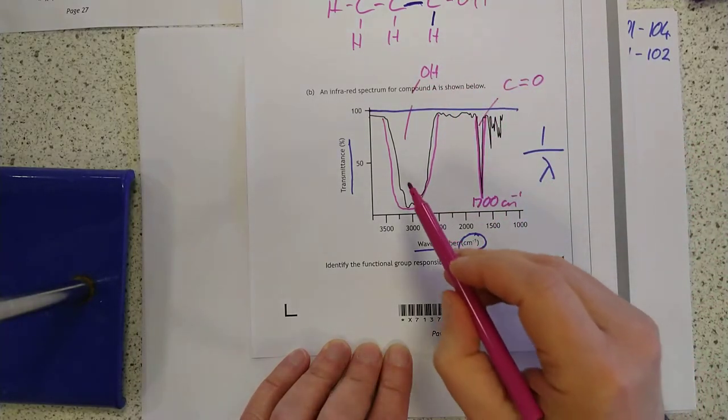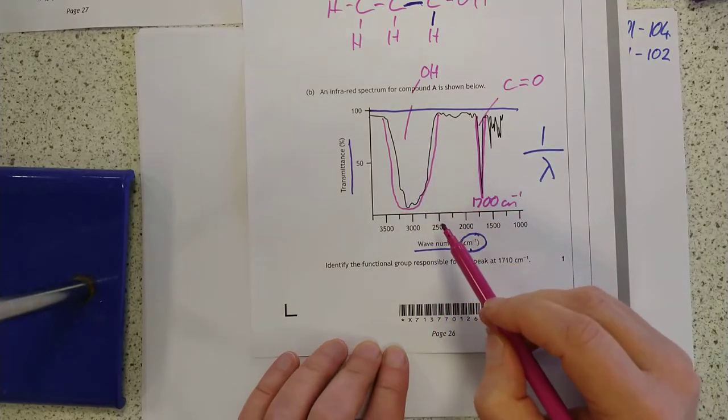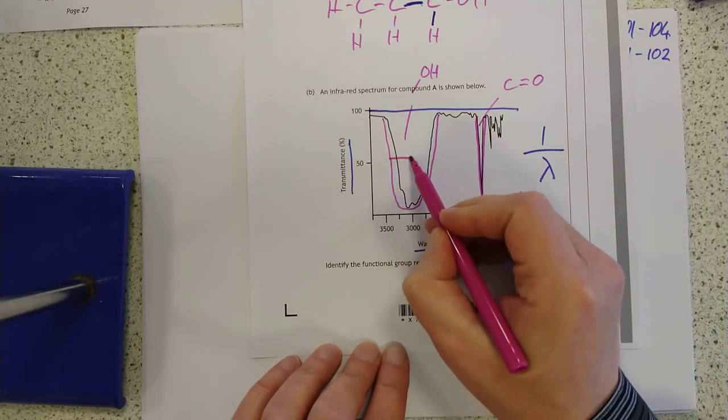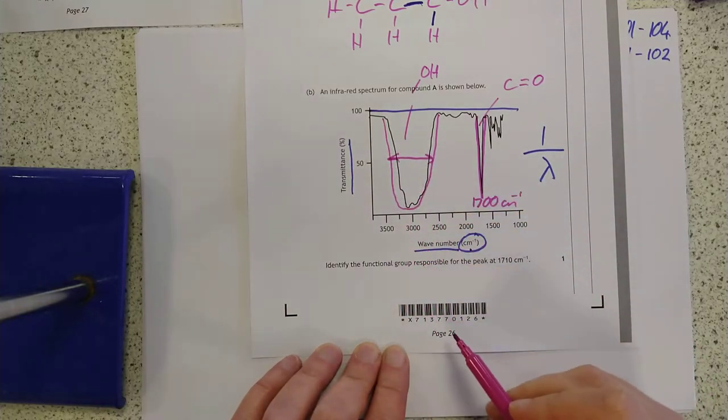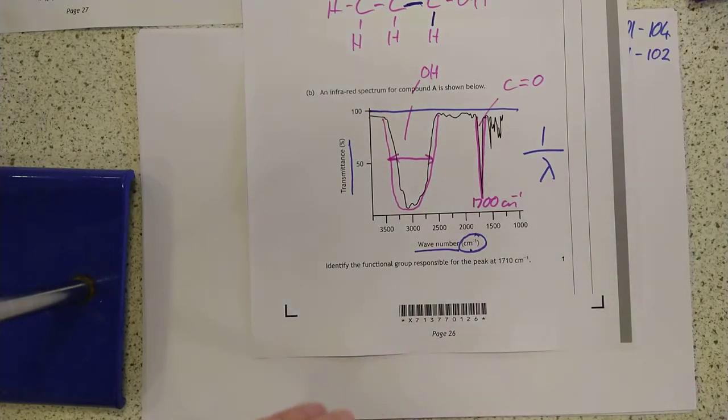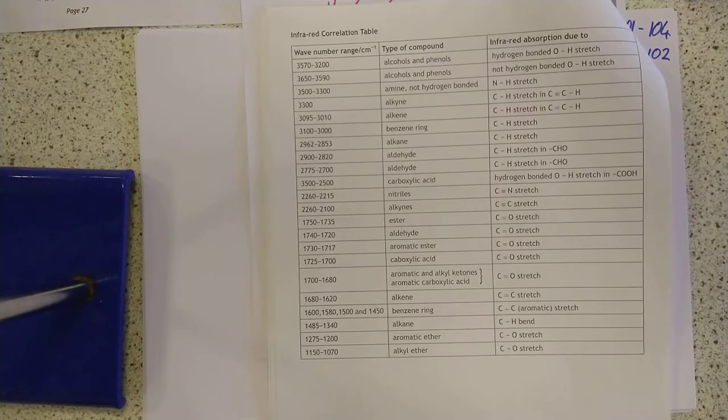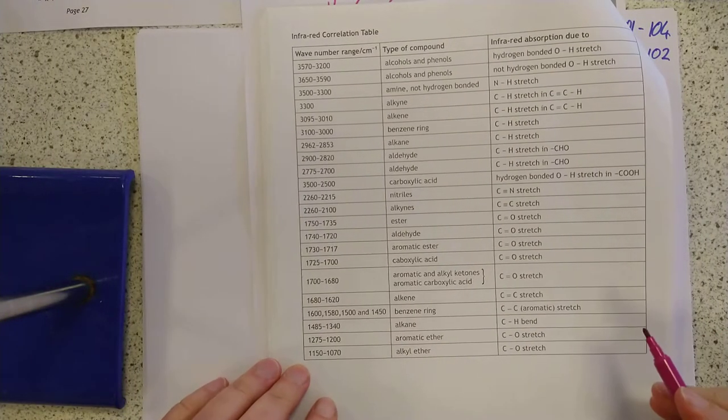On a technical basis, it's actually because the OHs interact with each other and you get hydrogen bonding. And that's why it absorbs across a huge variety of wave numbers. We're looking for the table on, let me just find it for you, page something of the data book. Here we go. We're on page 14 of the data book.